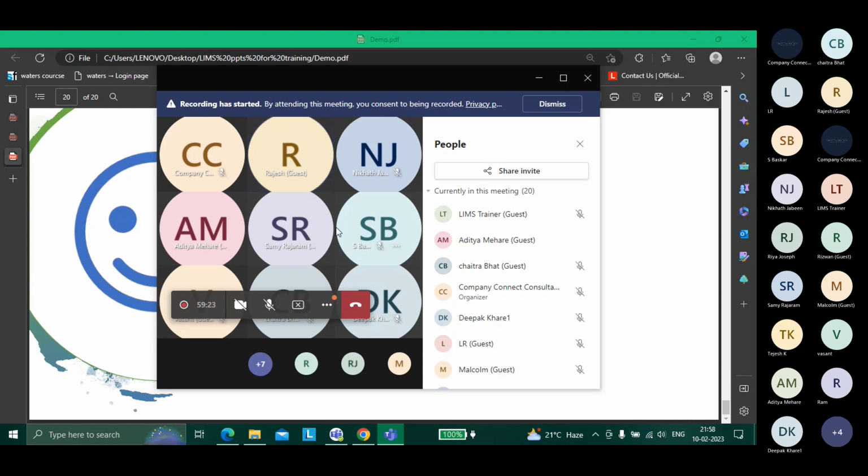From my side, I'll go through the slides and screenshots. I'll type something and tell you. But the way I'll teach, I'm quite sure you need to get into LIMS and get your hands dirty. I agree. But the way I'll teach, whatever topics I cover, you will understand even if you don't log into LIMS. That's how I taught the last batch, and I'm quite sure they were quite happy with it.